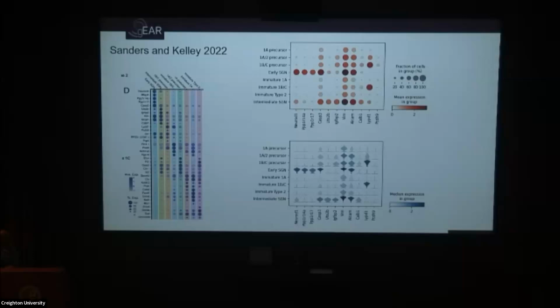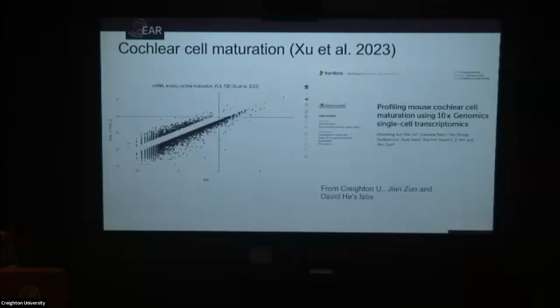The same thing applies to the heat maps. I took just a selection of these because there are a lot of genes, but we showed them two different ways. The same selection of genes is in the heat map, with the axes flipped, but also as violin plots instead of heat maps. You can see whichever views you prefer; both are available. And definitely, given how small this is, just interrupt if you have a question as we go. We don't need to wait until the end.